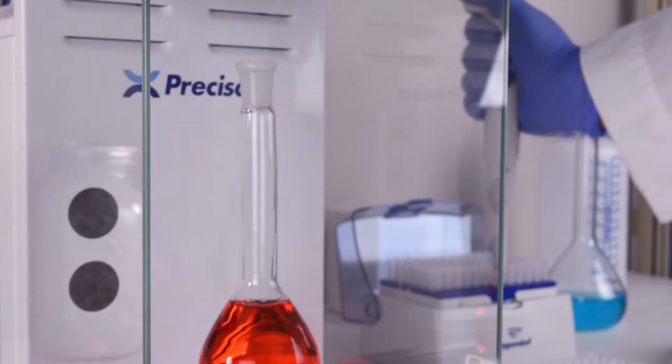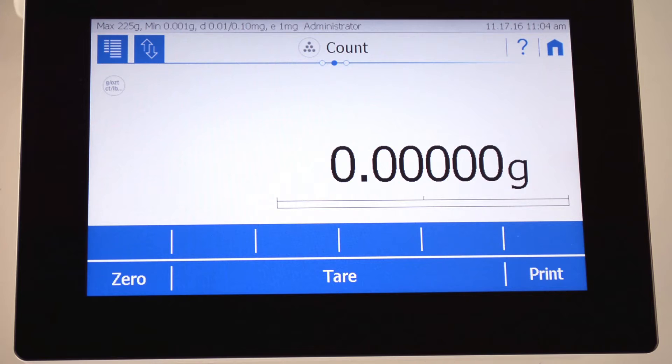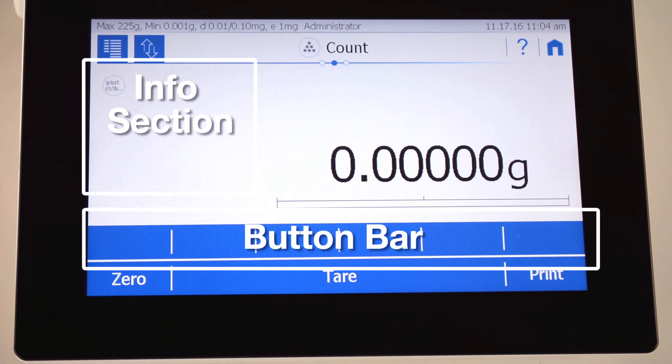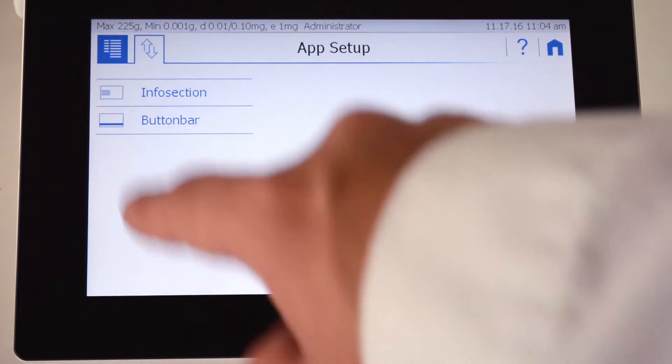Every user has completely different needs for their weighing applications. To cater to your application, the weighing screen has two customizable areas: the info section and the button bar. By tapping the button at the top of the screen, you can select presets to fill these areas for your specific application.